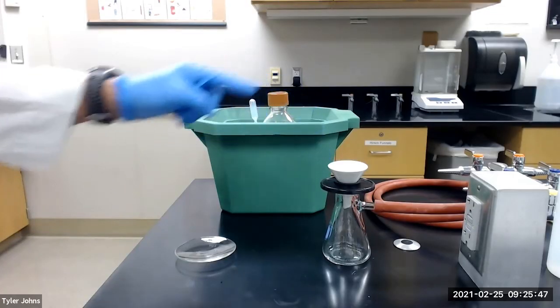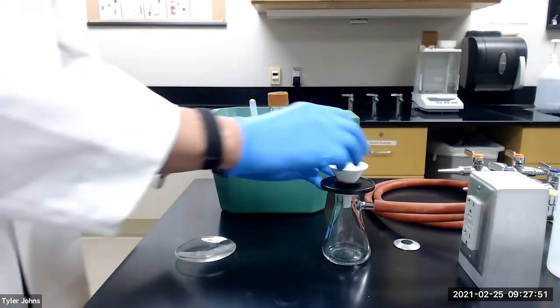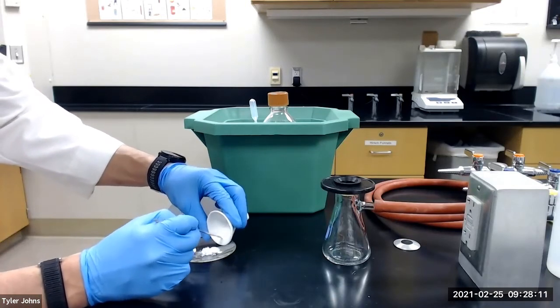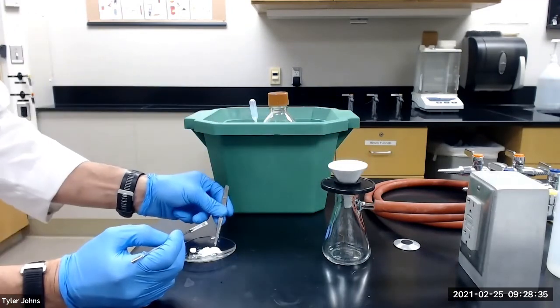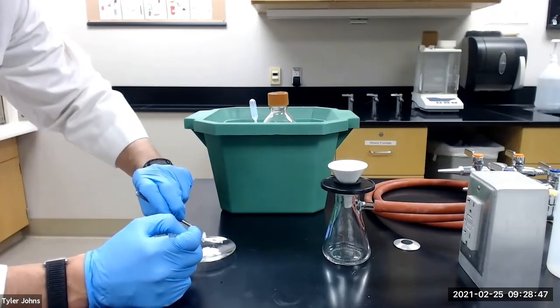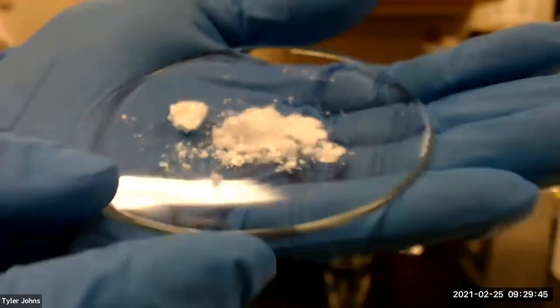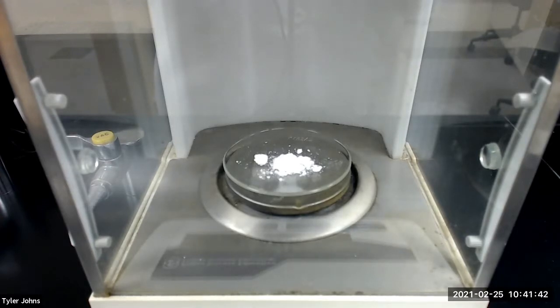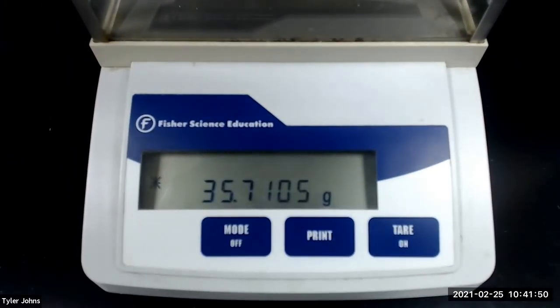We will next collect the crystals on the pre-weighed watch glass and then dry them for 30 minutes in an 80 degree Celsius oven. After drying, the mass of the pre-weighed watch glass and the purified product is 35.7105 grams.